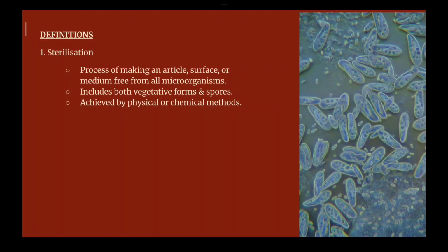Sterilization. This is a process of making an article, surface, or medium free from all microorganisms, which includes both the vegetative form and the spore form, and this is achieved by physical or chemical methods.